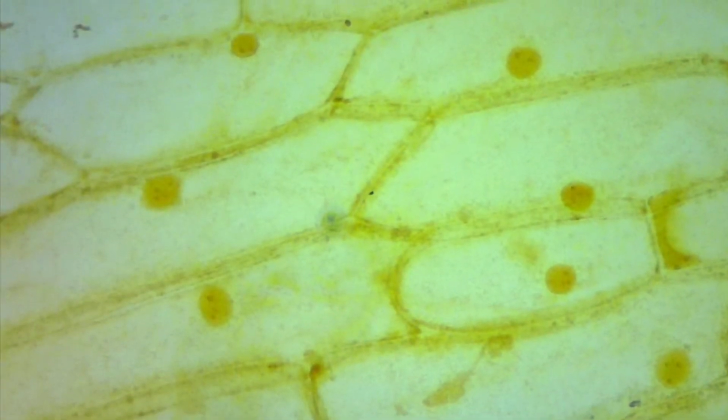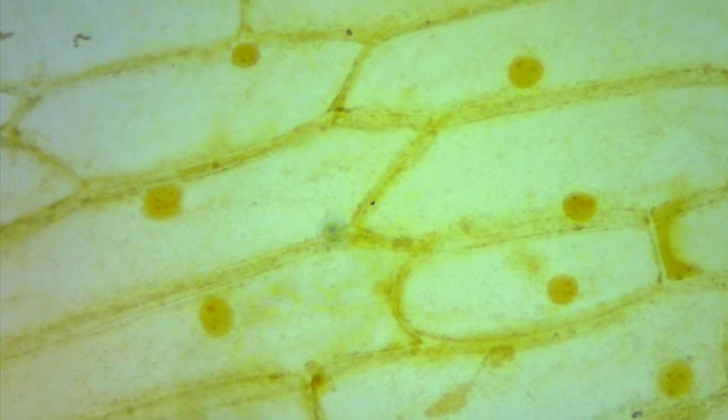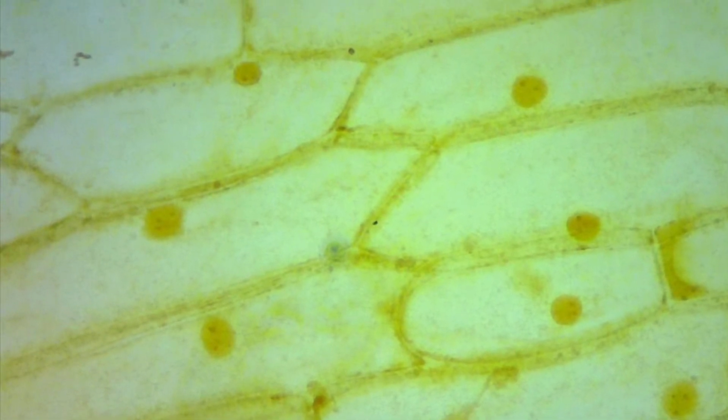Notice the nucleus. The nucleus is found in each cell. It is brown in color and circular. Each one of these nuclei, plural for nucleus, control the cell actions. Without a nucleus, the cell would die.